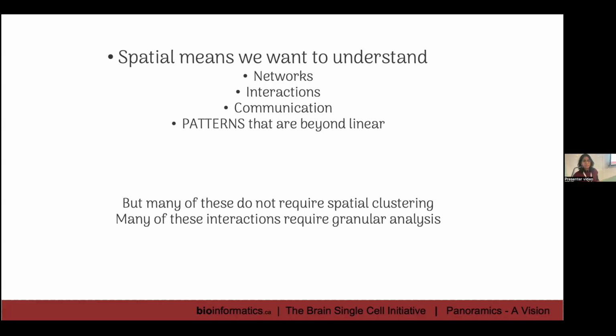These are all the things we need to consider when we want to look at patterns in tissue. But that doesn't mean it's super difficult. Some of you asked the question, what is the best method? I think the best method is usually the easiest method. Try the easiest method, because all these algorithms have flaws. But if you look at all benchmarking standards, they still pick up patterns in one way or another. So you evaluate using the simplest method first. You get over that first threshold.